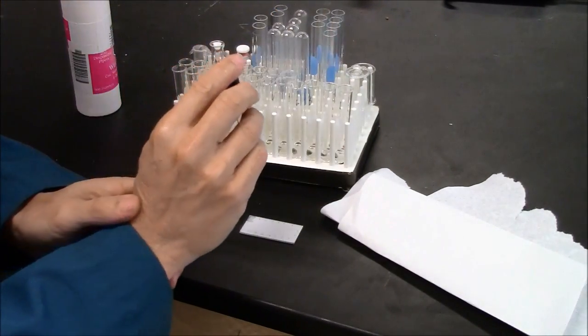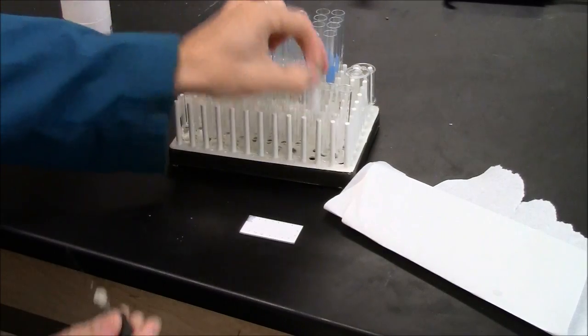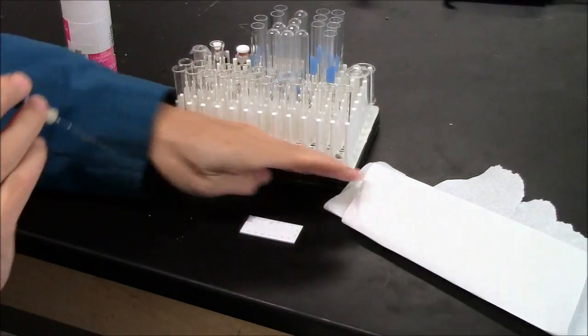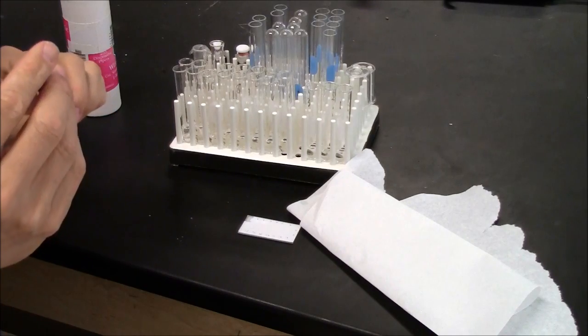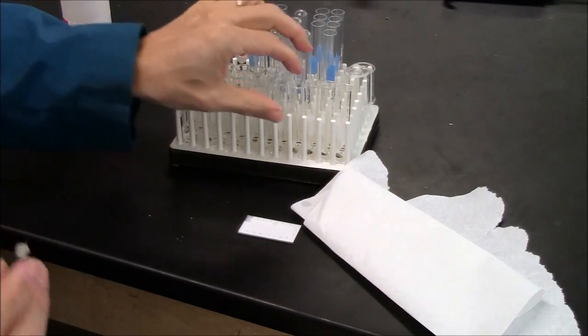The amount of cross-contamination I'll get with this is minuscule. There's a spot for fraction 2, empty the contents. Spot for fraction number 3 is next. So you can see I can do many spots in a minute, and I just put 1 spot for each fraction. Size of the spots, not important. I'm just seeing, is there anything in there?